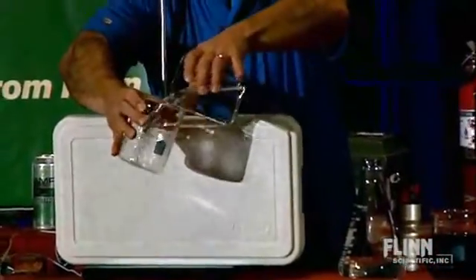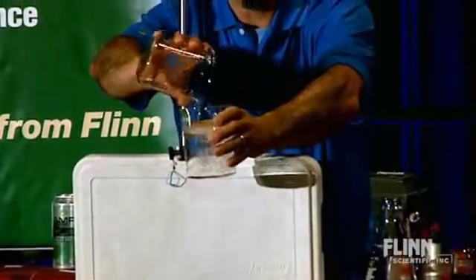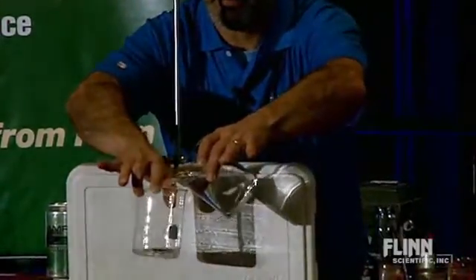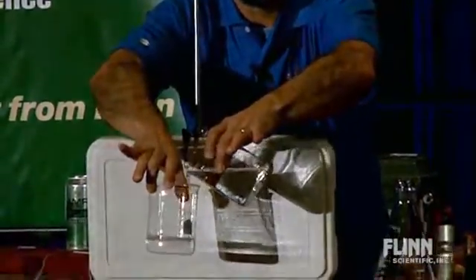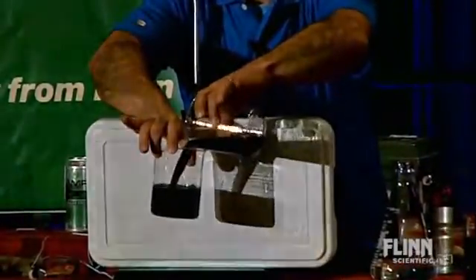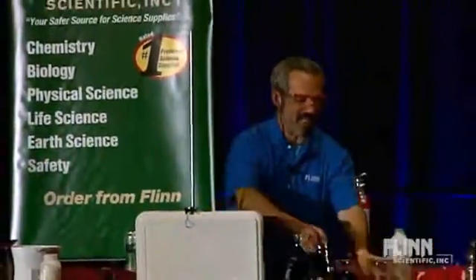I'm going to pour it this time — once, twice. Yeah, I'll make it three times. And I'm just going to keep pouring here. What's going to happen now? Of course.